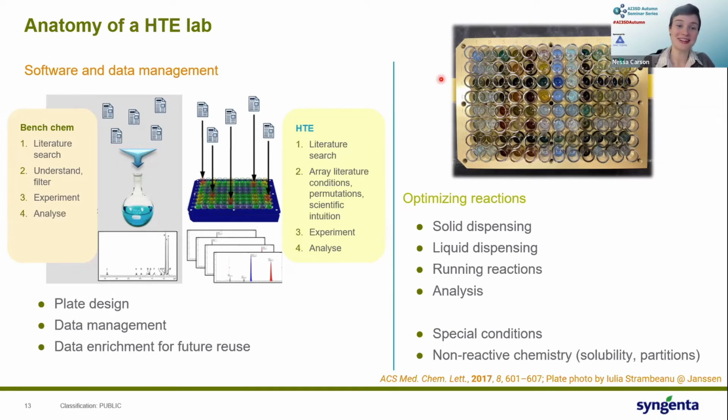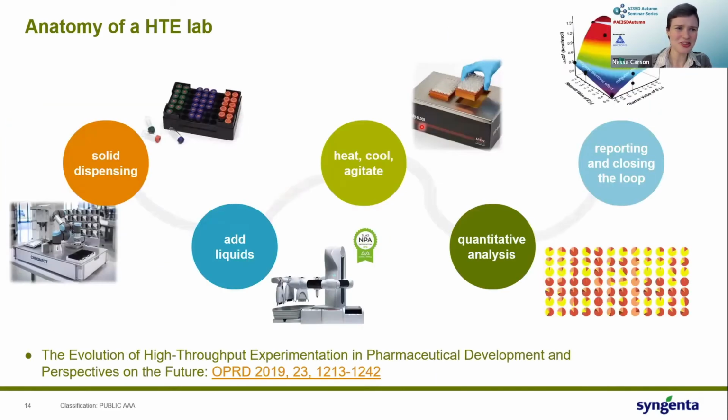So once you've picked out your ligands that you really expect to work, then for me that's time to move on to some, not silly ones, but definitely a bit more out of left field. High throughput is an opportunity to be doing that. I guess I'll show on the next slide how this works.